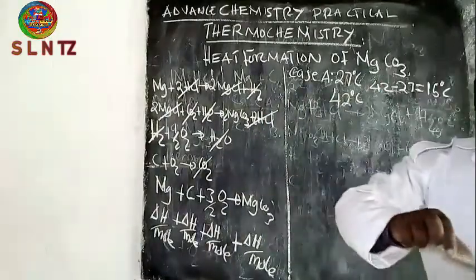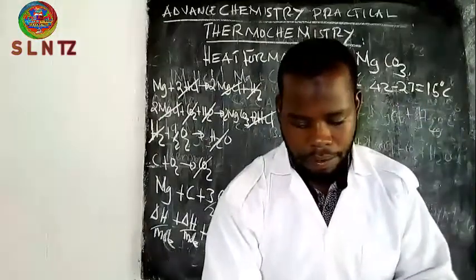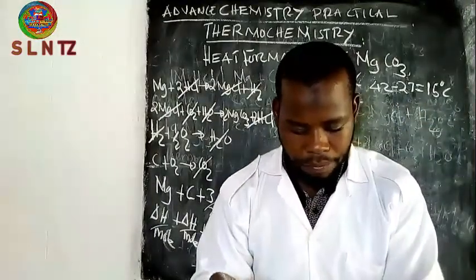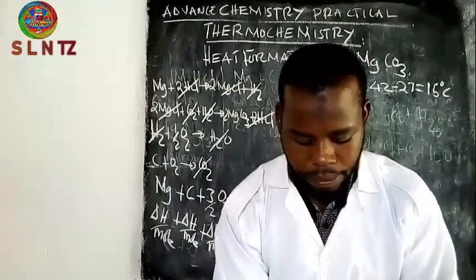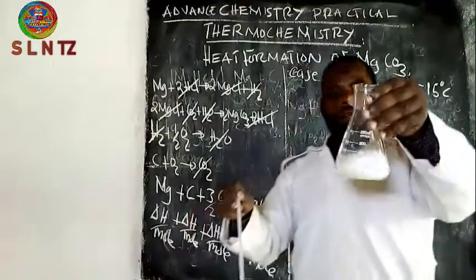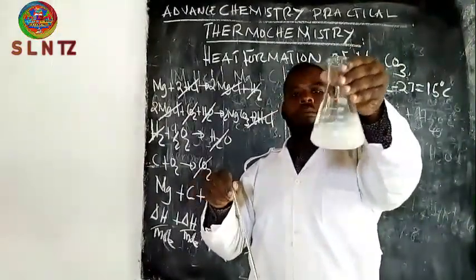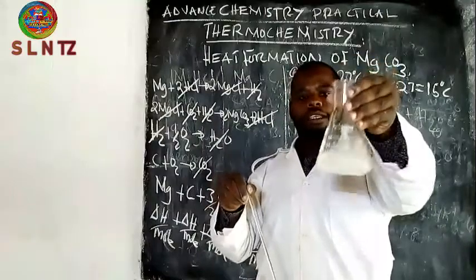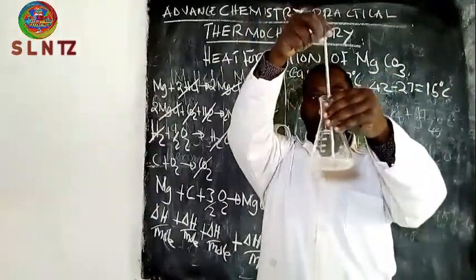We pour magnesium carbonate. Also, you see there is gas, carbon dioxide, given out. Anyway, make sure you record.